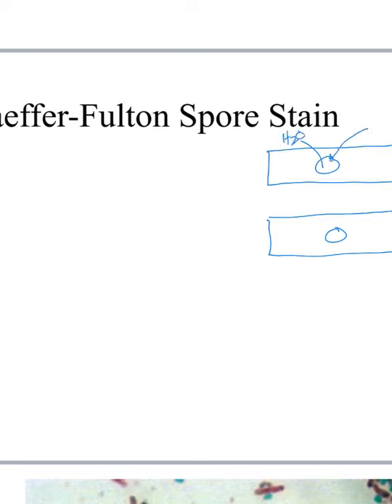On one slide, you're going to mix in, say we're using Clostridium sporogenes, whatever our example of a spore former is. I would say you can use your needle to mix that in there, because when you use your loop, you just tend to get way too many cells, and they're all pressed together, and you can't see their shape.